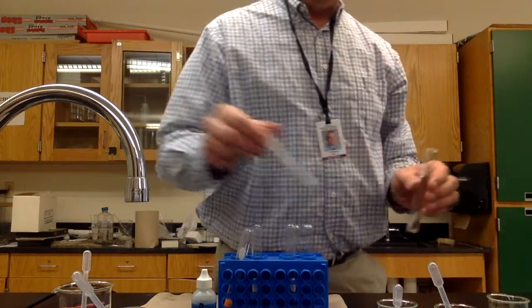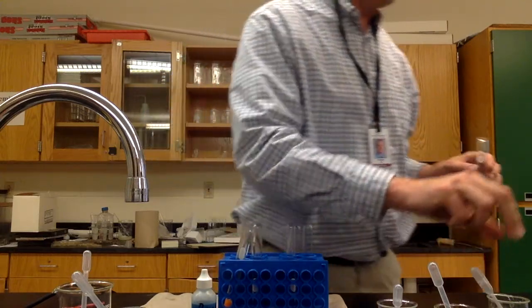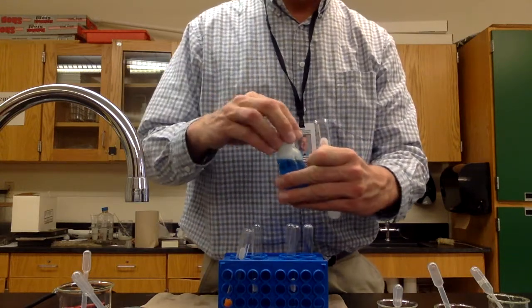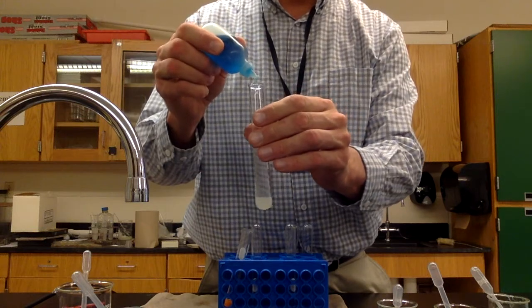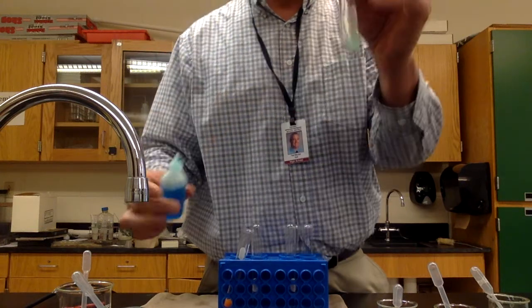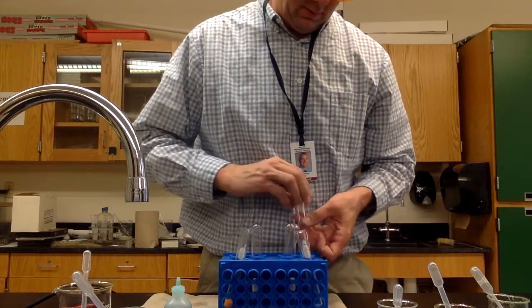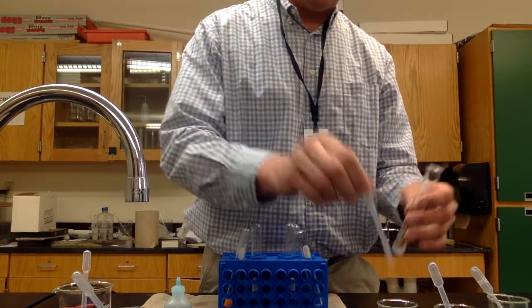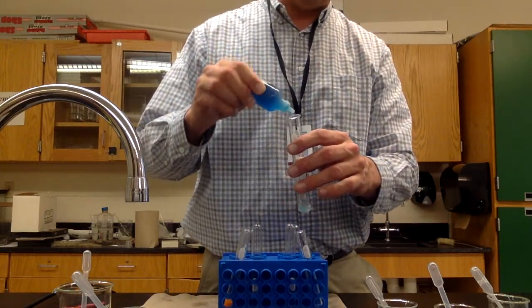Okay, so once again, I use a whole dropper full of the unknown. And then 5 drops of Benedict's. 1, 2, 3, 4, 5. Okay, this is my C. Dropper full of the unknown. 5 drops of Benedict's.